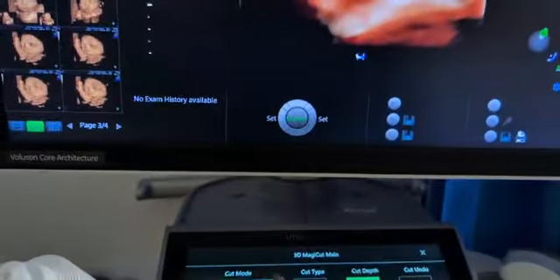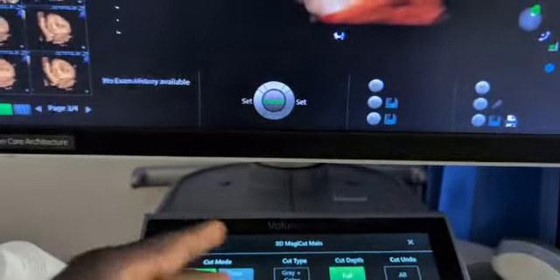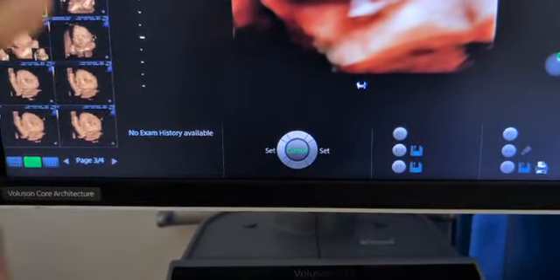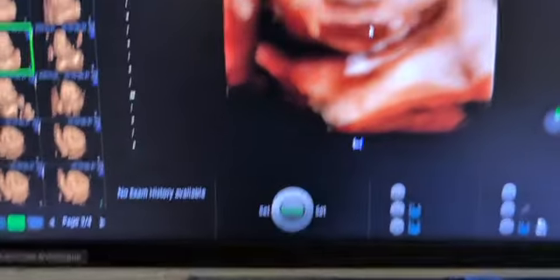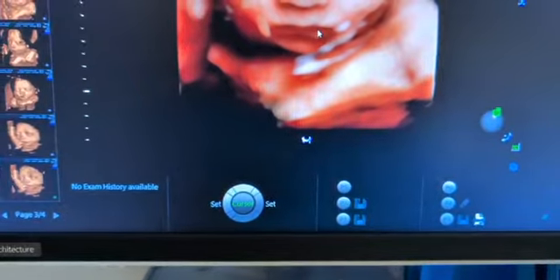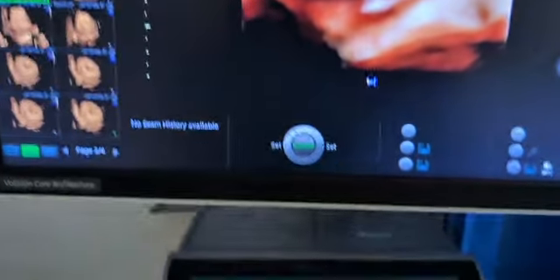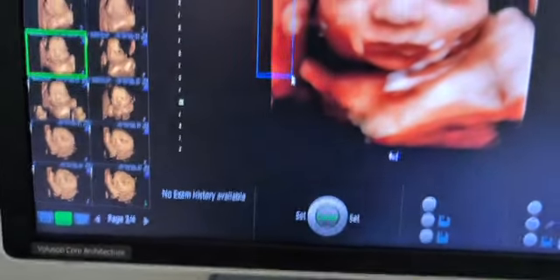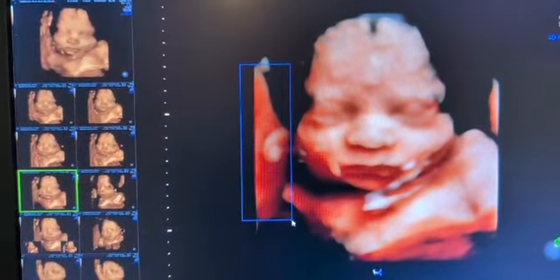So you can manipulate all of that. Same thing: if you trace inside, the part inside is the one that remains, and the one outside is gone from the image. So depending on what you want, you can box in or box out. If I use box in, you see, it's just a box. Instead of tracing, you draw the box, same thing.